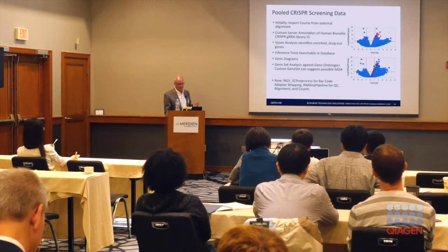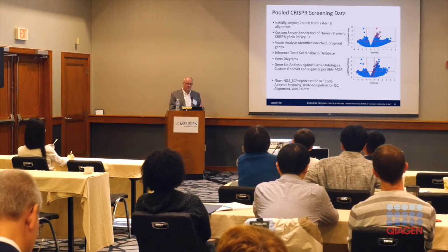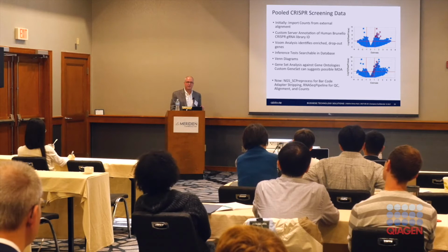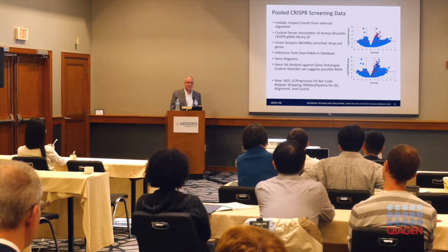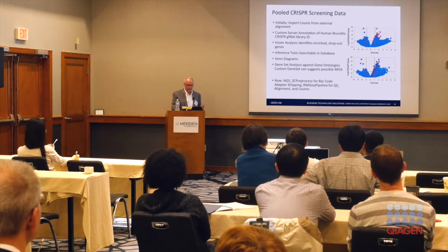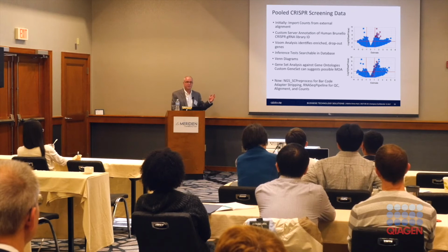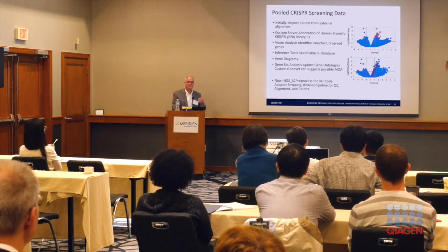And VOOM has been adequate to show which of the genes are enriched or dropped out in some kind of positive selection screen. So we're not using any fancy magic analysis or whatever. We just took the counts and do VOOM, and we can see really what's going on. And then we can use all the other tools once again, gene set analysis, whatever, to understand what's maybe driving those hits.